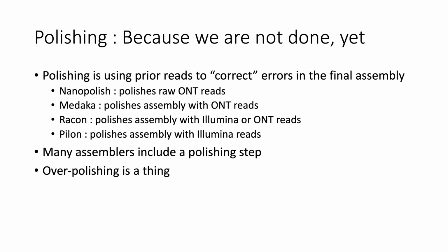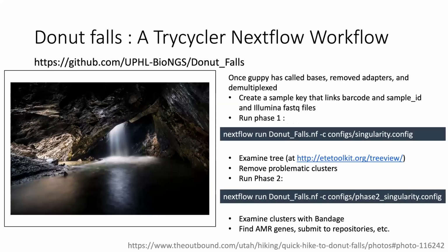And then if you guys want to join in on the bandwagon, I'm in the process of creating a Trycycler Nextflow workflow. Because Trycycler has a human requirement in it after clustering and before reconciliation, it's not a complete workflow that takes it from FASTQ reads to final polished assembly.